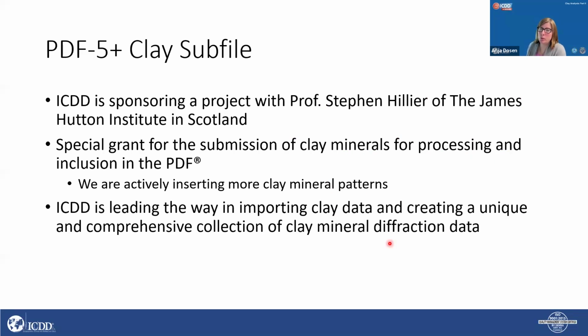We have this new project that I want to talk about for a bit. It's a collaboration with Professor Stephen Hillier of the James Hutton Institute in Scotland. We have created a special grant for the submission of clay minerals for processing and inclusion in the PDF database. And through this project, we're actively inserting more clay mineral patterns, which means that each time we have a new version of our database, we will have a more comprehensive clay mineral subset.